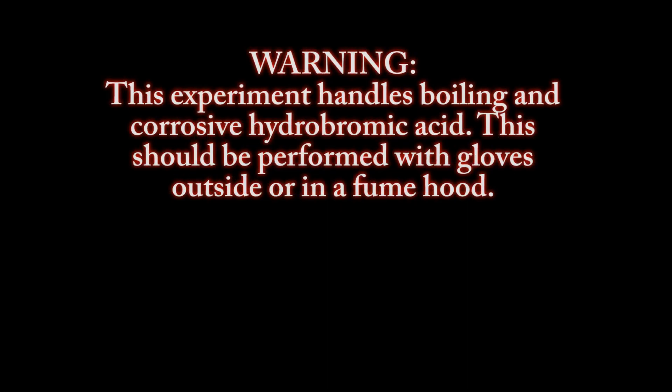Warning: this experiment handles boiling and corrosive hydrobromic acid. This should be performed with gloves outside or in a fume hood.